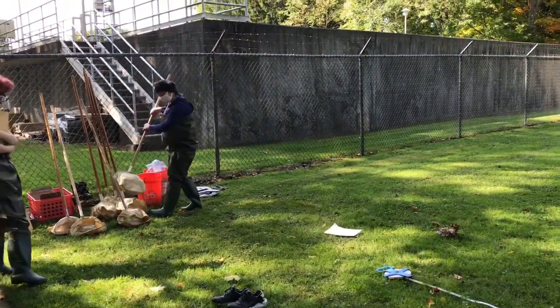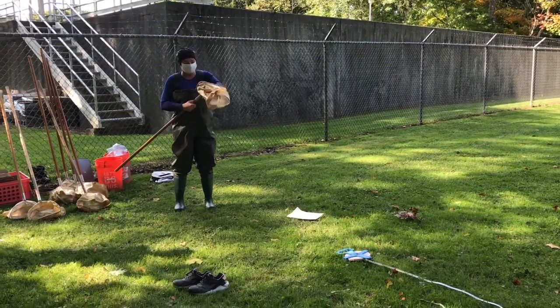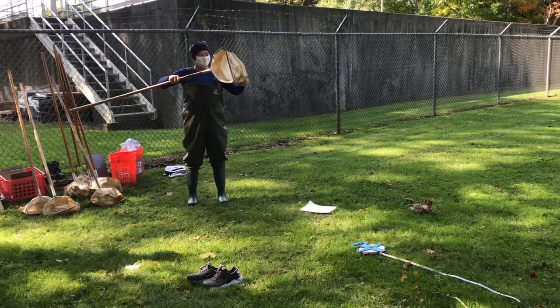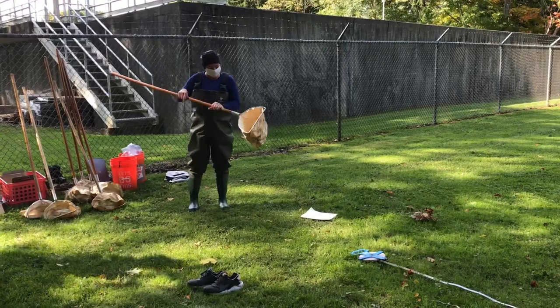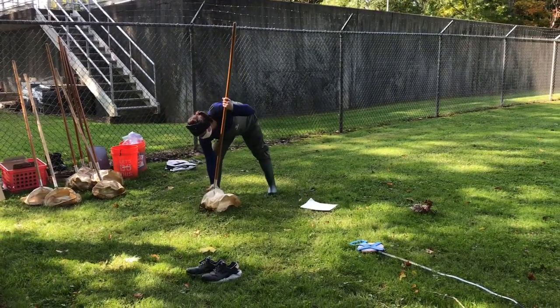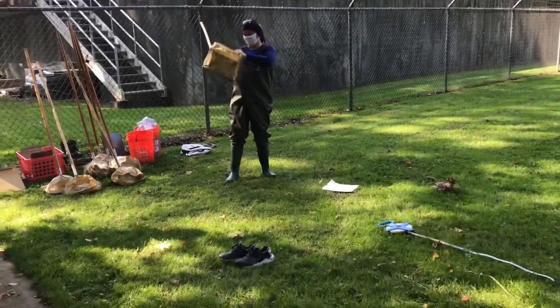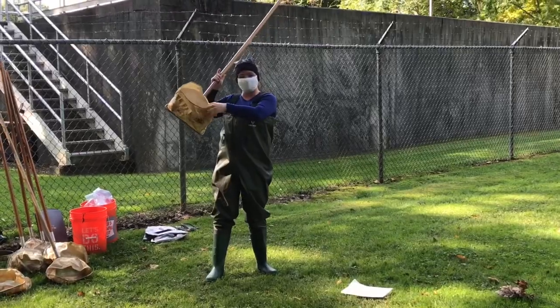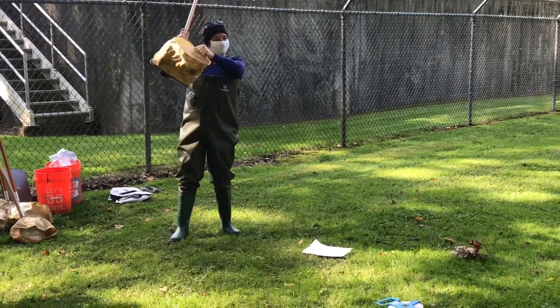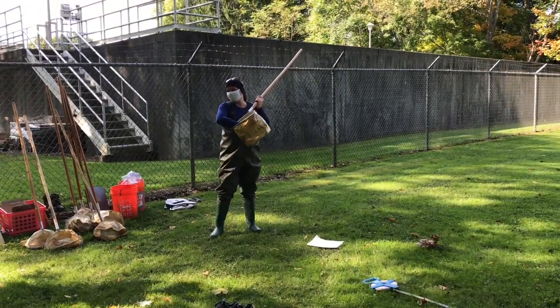These are aquatic D-net samplers, and they're called D-nets because they are D-shaped. Great. And what you're going to do is set them down in the stream so that water's flowing into the big part of the net. There's a big part of the net. There's a really small part of the net, non-sampling area. You don't want to try to collect things in this small side. Not smart, right? You want to collect things in the big part.